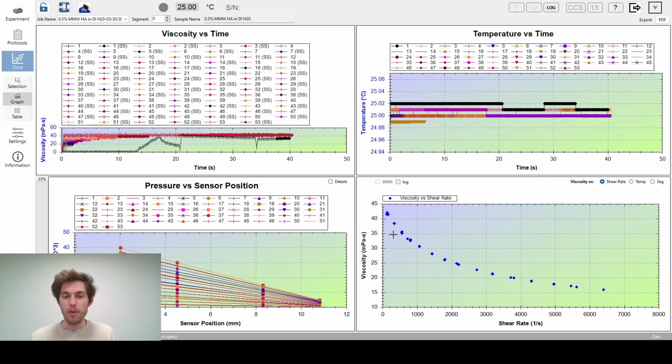story. So at those lower shear rates, starting at around 500 like we did on the microvisc, you can see we're hovering right around 40, and then as we increase shear rate, we're seeing that drop off towards 25, around the 3,000, and then going even beyond that all the way up to what looks like 6,300 inverse seconds. And you can see that non-Newtonian behavior, that shear thinning behavior, keeps dropping our viscosity as we increase the shear rate. So we got a little taste of that full profile on the microvisc, but we can see that behavior goes even beyond.